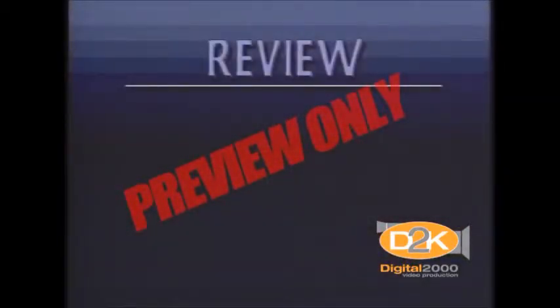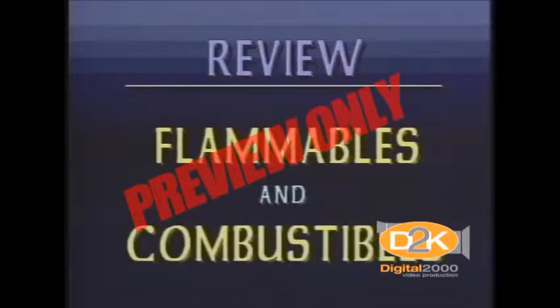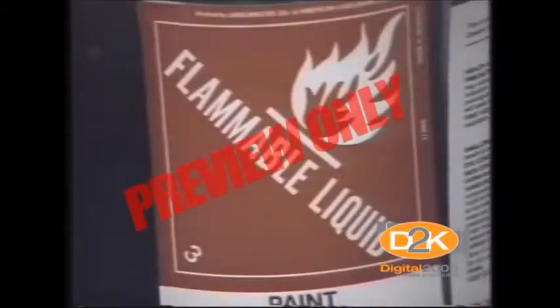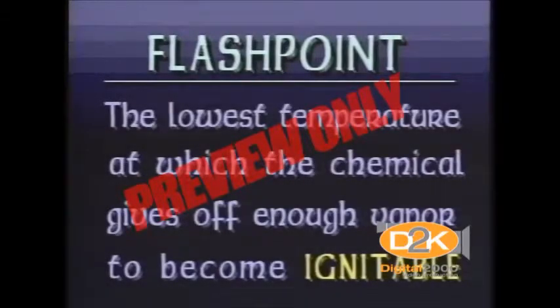Of course, the old standbys, flammables and combustibles, are also classes of liquids requiring special attention and respect. Flammable liquids are those liquids with a flash point of 100 degrees Fahrenheit or lower. Acetone, gasoline, carbon disulfide, and others fall into this category. The flash point of a liquid is the lowest temperature at which the liquid gives off enough vapor in a test vessel to form an ignitable mixture with air to produce a flame when a source of ignition is brought close to the surface of the liquid.